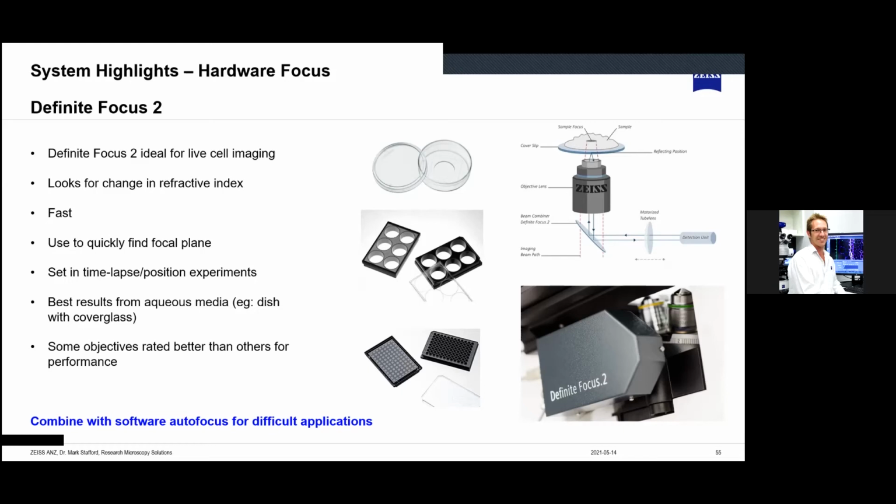And then in the, I think it's called, focus strategy, you also have to click which one you want to use, right? Well, it will ask you at the start of the experiment to pick that first focus point that you want. It depends on how you set up that focus strategy, to be honest. I would probably have to show you on the instrument, but if you've already stored the focus, then you've stored the focus when you start the experiment. Essentially, there's multiple ways that you can do it. There are multiple parts in the software for doing the same thing, depending on where you are. Okay.